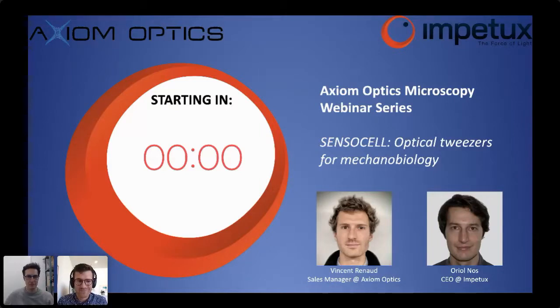Hello, everyone. For this first session, we're going to discuss the SENSOCELL optical tweezers and force measurement platform dedicated to mechanobiology. And so first of all, welcome everyone.